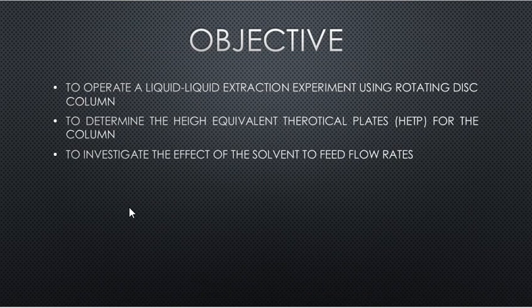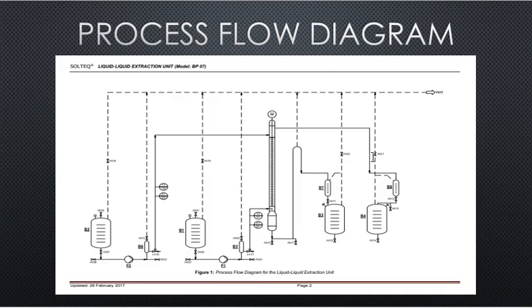So the objectives of this experiment are: first, to operate a liquid extraction experiment using a rotating disc column. Second, to determine the height equivalent to a theoretical plate, which is HETP, for the column. And the last one is to investigate the effect of the solvent to feed flow rates.